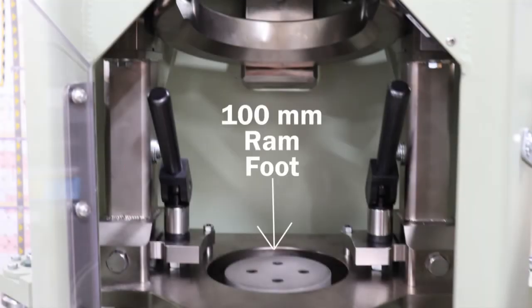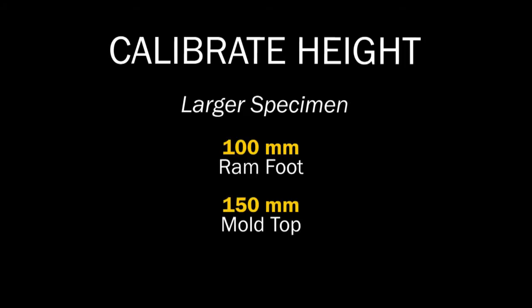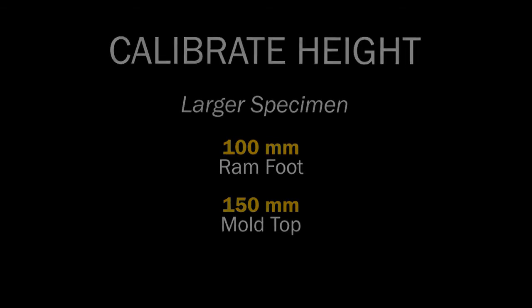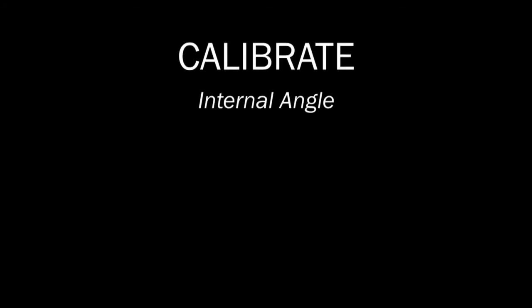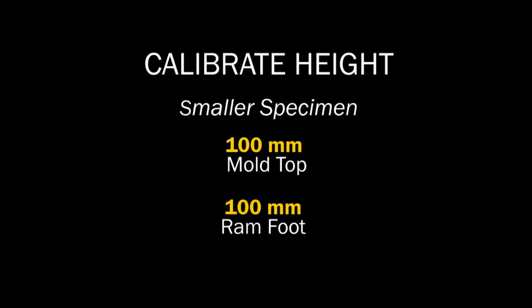You will first install the 100 millimeter ram foot. Then calibrate the height for the larger specimen size using the 100 millimeter ram foot and the 150 millimeter mold top. This is assuming that the force has already been calibrated. Then calibrate the internal angle of gyration using the 150 millimeter mold top and the 100 millimeter ram foot. Lastly, calibrate the height for the smaller specimen size using the 100 millimeter mold top and 100 millimeter ram foot.